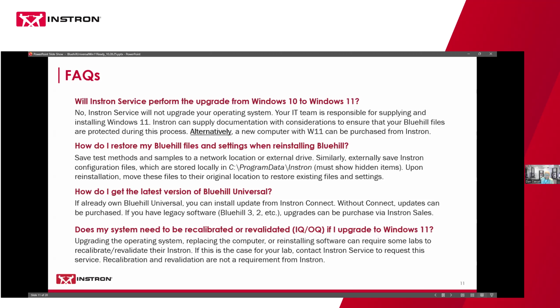And so whether you're upgrading the operating system, you're replacing the computer, or if you're reinstalling Bluehill software, those changes can raise a flag for some labs and their quality teams that they need to recalibrate or revalidate their Instron.